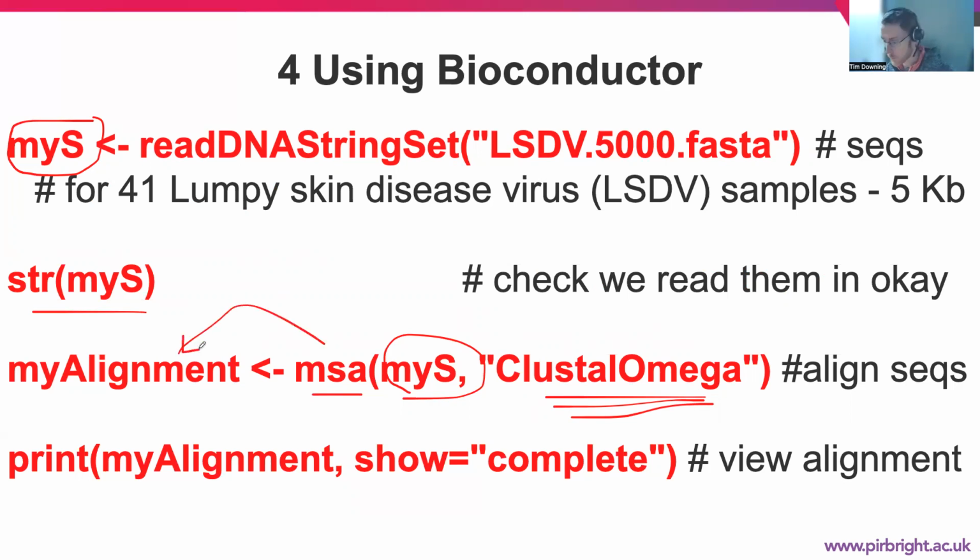Note that obviously we're not optimizing our alignment here. This is just an illustration of how you can align sequences if you wish to do so in R. If you actually want to align things properly, there's quite a few additional steps to think about. But we can check our alignment by printing it out and having an eyeball to see if it actually worked properly. If you use something that's very divergent, obviously it may not align properly at all.